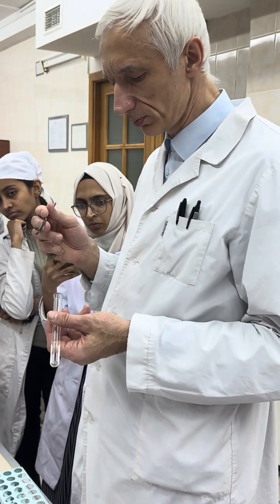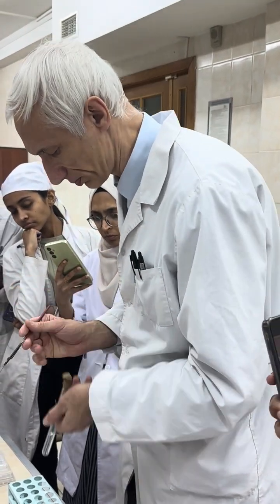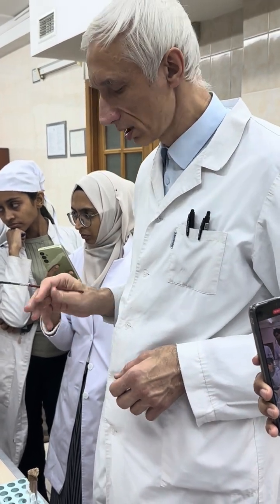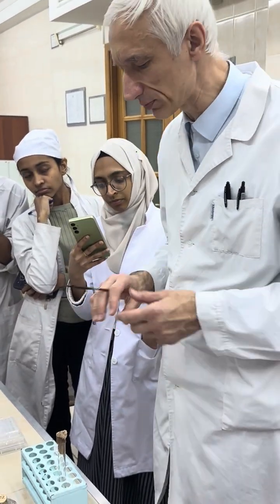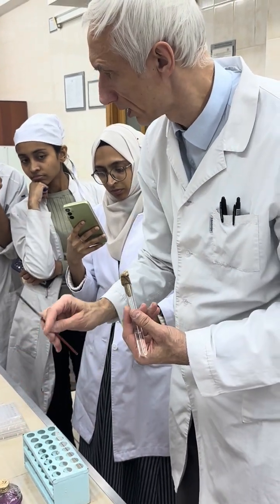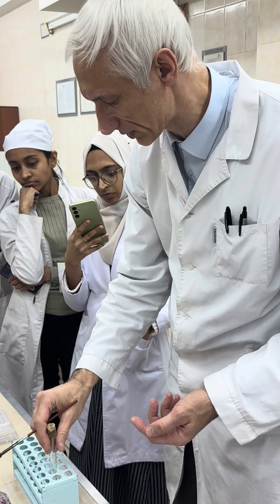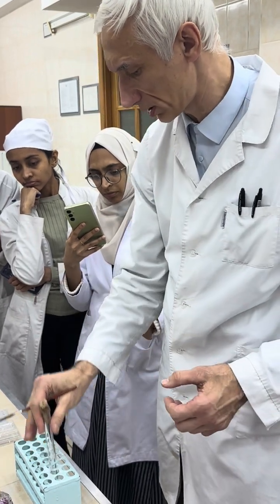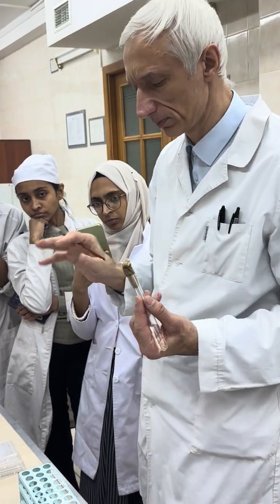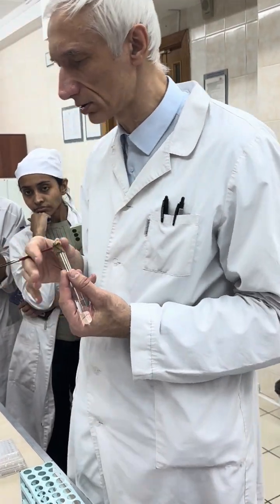Don't forget to cool the loop and take a drop of saline. Close it, put it away. So, how do you remove the test tube from the stand? Various versions are possible. Sometimes students first take the test tube, then take the loop. That is not a mistake. I prefer to take this one first, then apply with my free fingers. A little bit more rapid, but as you like. Not a problem.